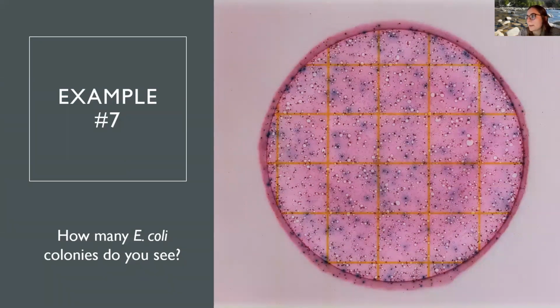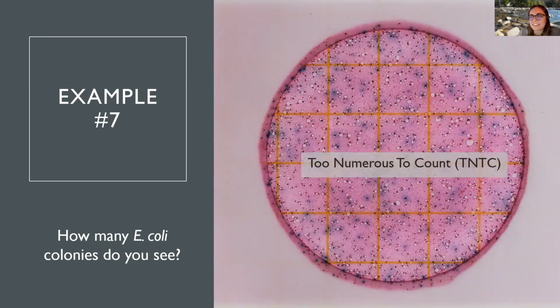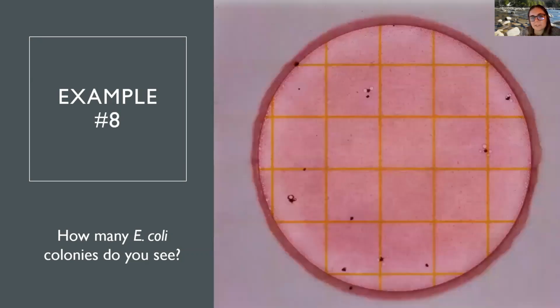Absolutely. We can see the color change. Yeah, Michelle says, TNTC, we have a problem. That's exactly correct. So that's again too numerous to count.